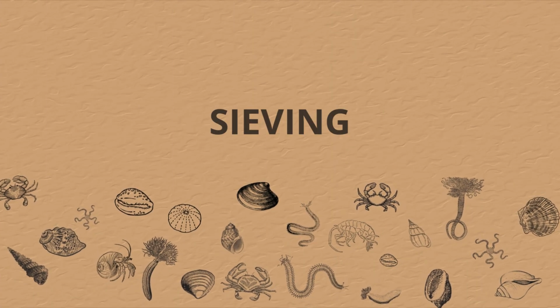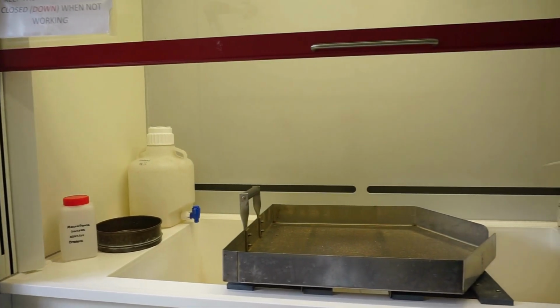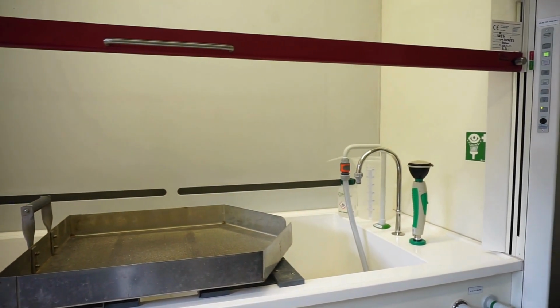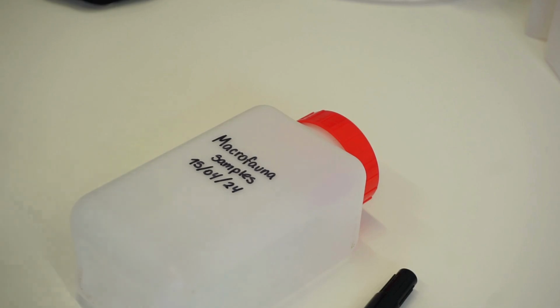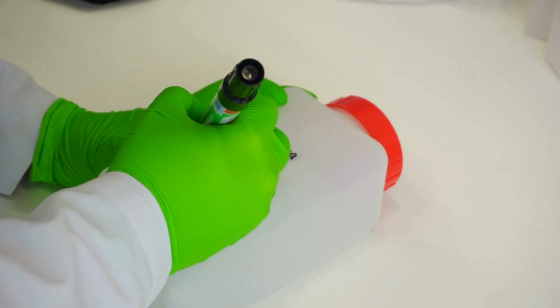Sieving. After sampling, the macrofauna is separated from the sediments by sieving it. Each sample should be sieved and stored separately. It's important to label the storage pots with date of extraction, content, location, and name of the scientist.